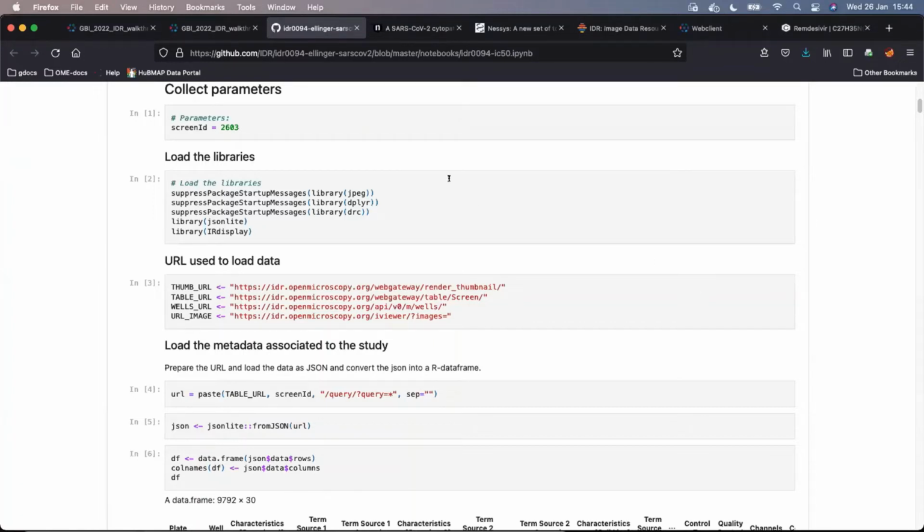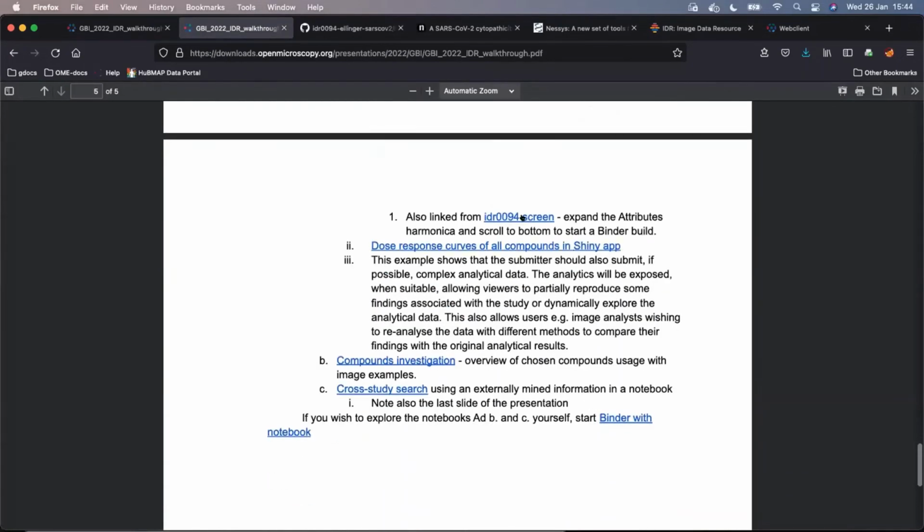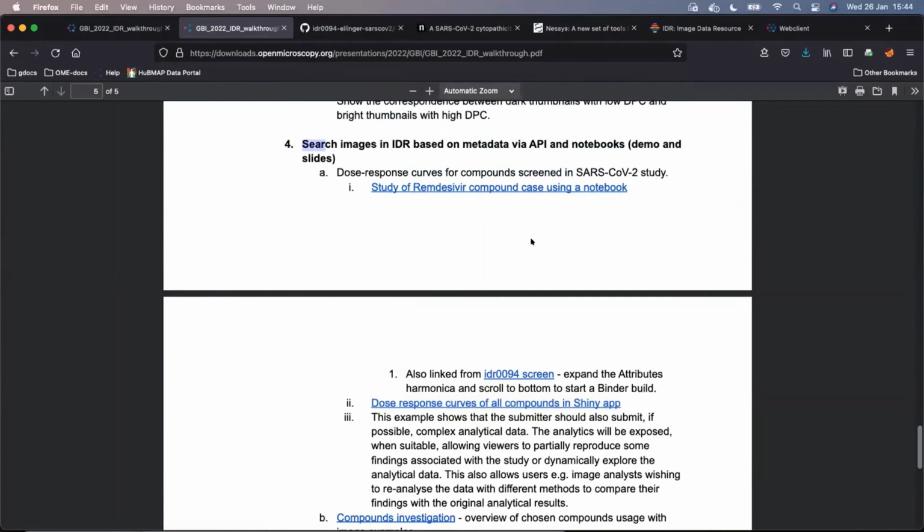Okay, thank you very much for this helpful comment. Yes, I will not now try to find the proper notebook with the public credentials, but definitely there are different ways how this is done, and some of those notebooks are of course in the walkthrough.